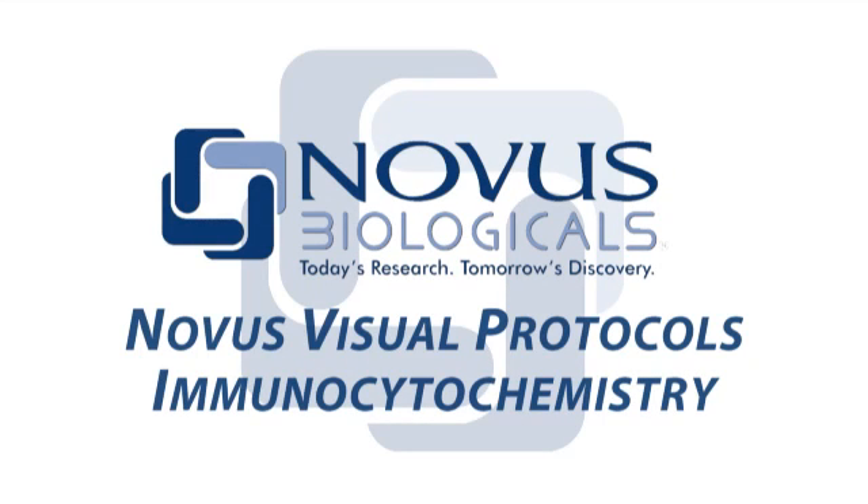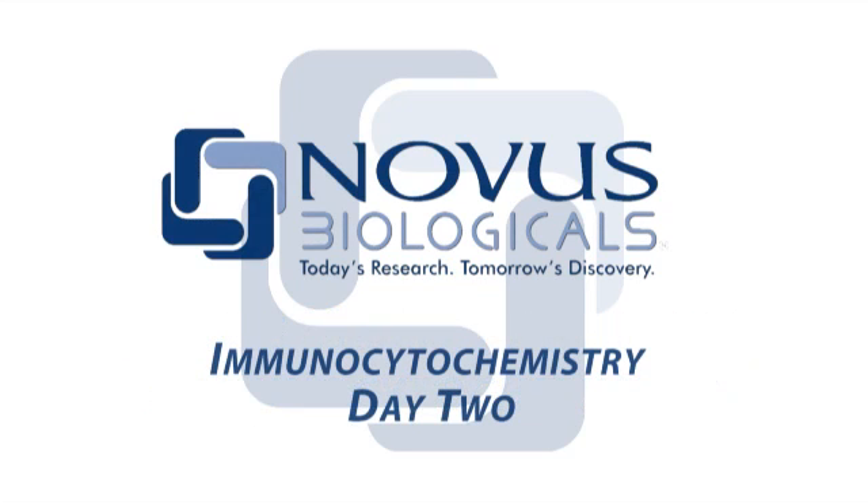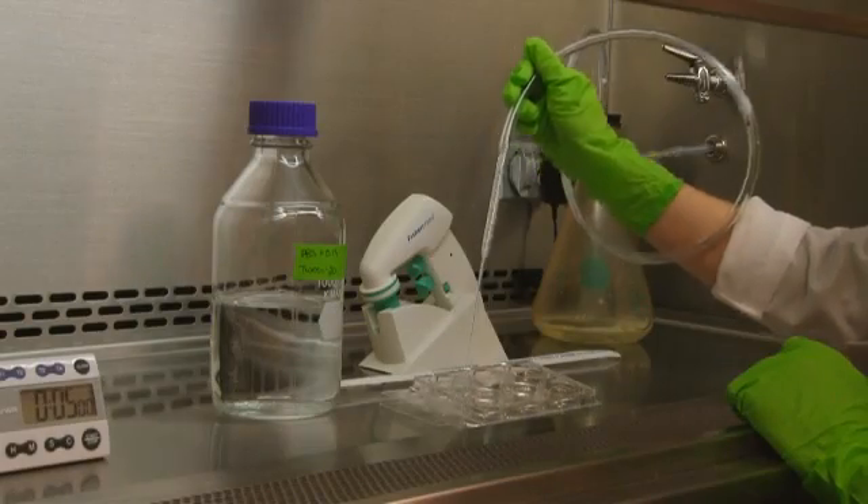In day two of our ICC procedure, we will add our secondary antibody, perform an optional double labeling and nuclear labeling step, mount our cover slips to slides, and obtain images of our antibodies with a fluorescent microscope.